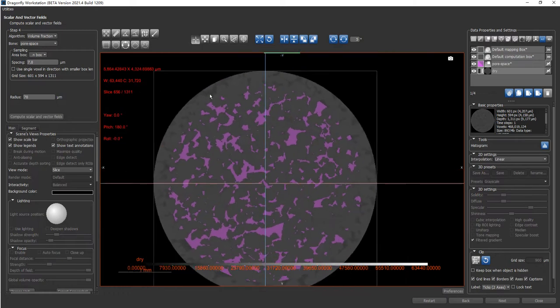The original image, we can see it here, is about 600 pixels wide and almost 600 pixels high and 1300 pixels deep. We could do a mapping which doesn't have to have the same pixel size as the original image data.